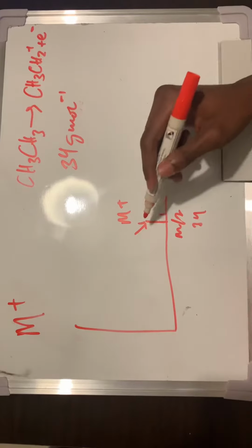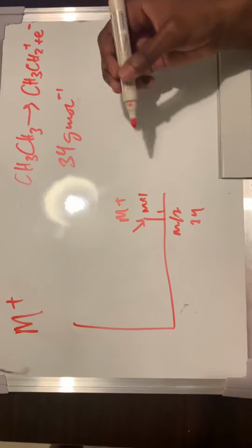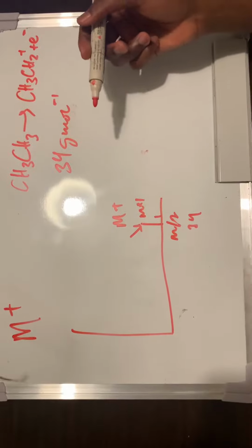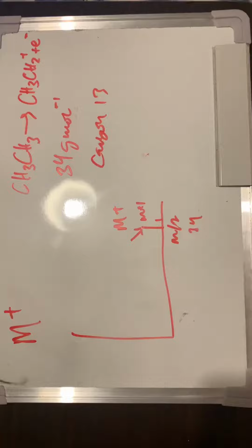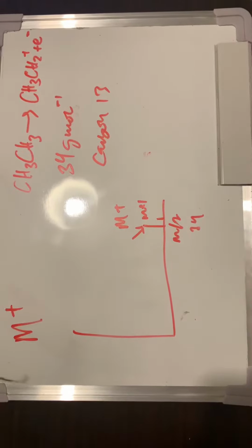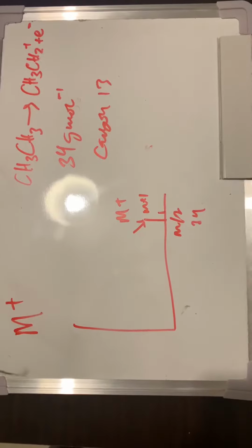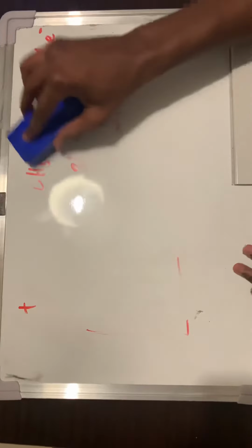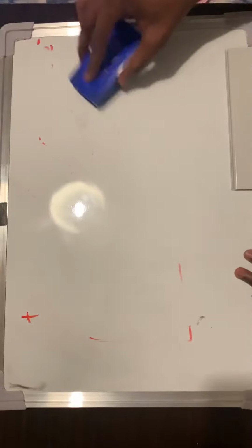The peak right beside the M+ peak is the M+1 peak, and this is generally formed from an isotope. An example of this, in this case, would be a carbon-13 isotope forming an M+1 peak, which is normally really tiny, so we don't need to pay too much mind to it. So why this is important is because two molecules can be differentiated through this process because of fragmentation.